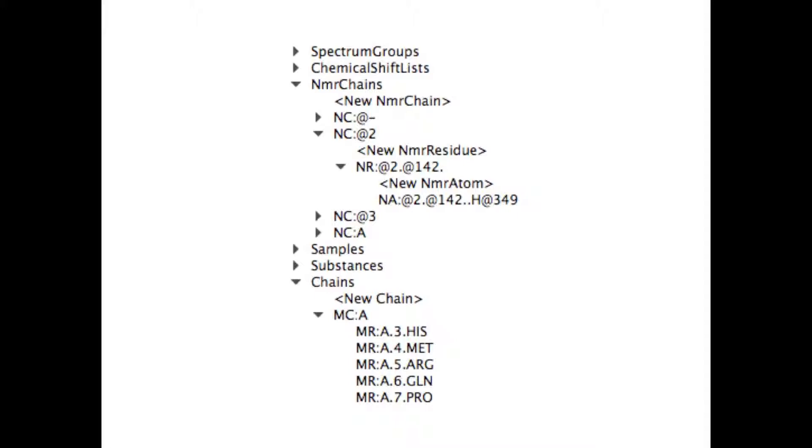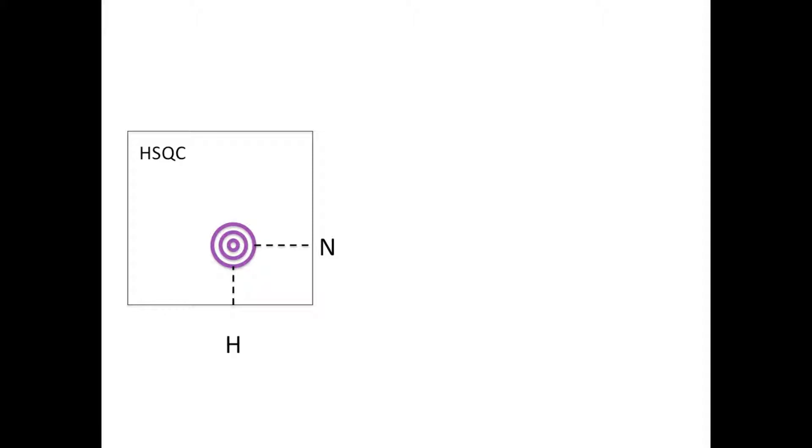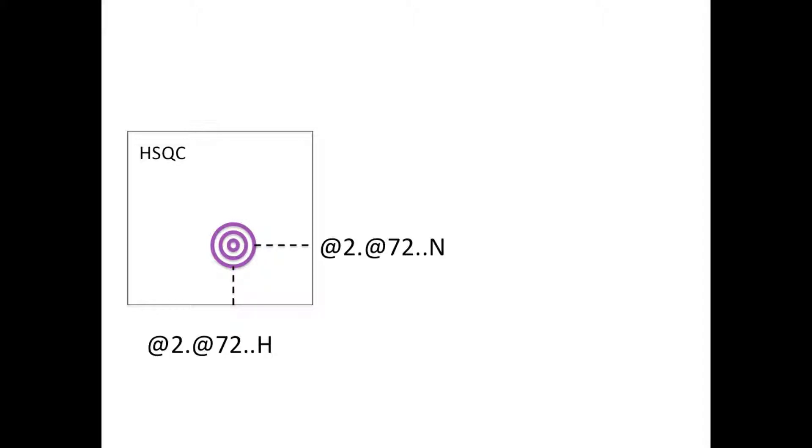So how do you work with NMR atoms and residues in your spectra and with your peaks? In a spectrum, each dimension of a peak is associated with a chemical shift, which in turn is associated with a particular atom. So in the 2D HSQC, for example, each peak has one dimension belonging to a hydrogen atom and one to a nitrogen atom. Therefore, in the absence of an assignment, each of these two peak dimensions is associated with one NMR atom.